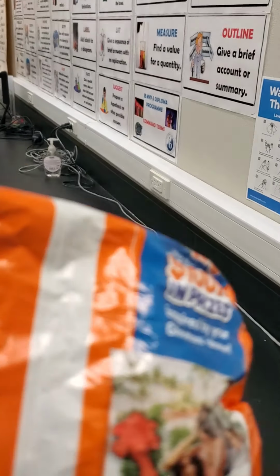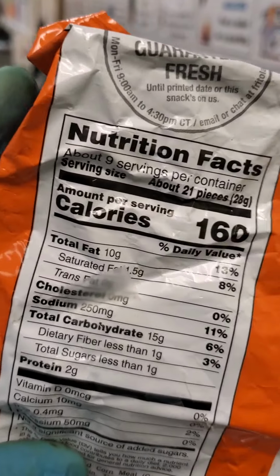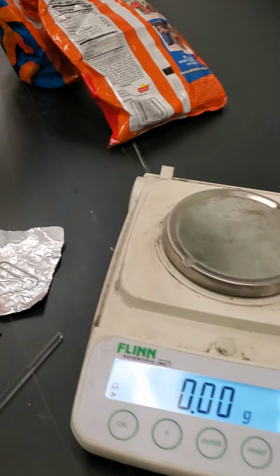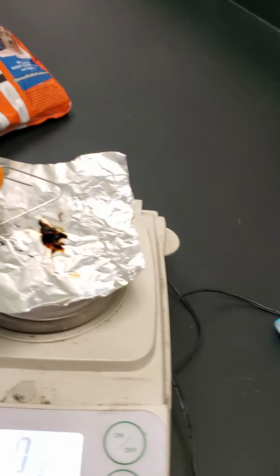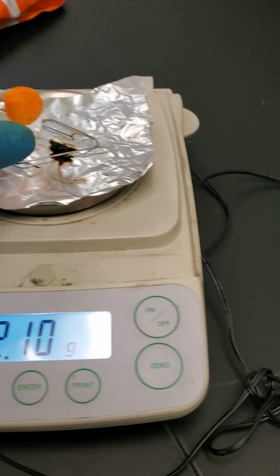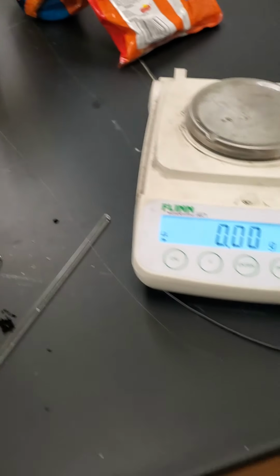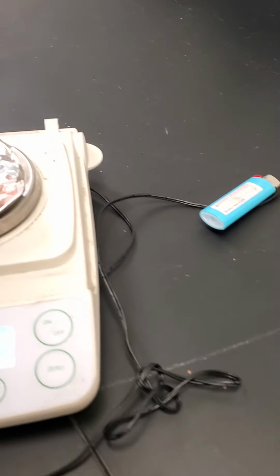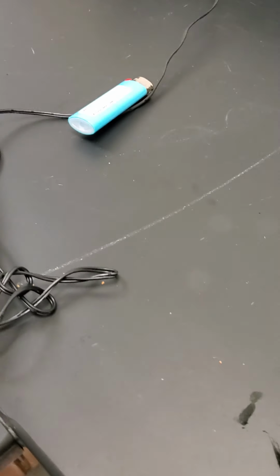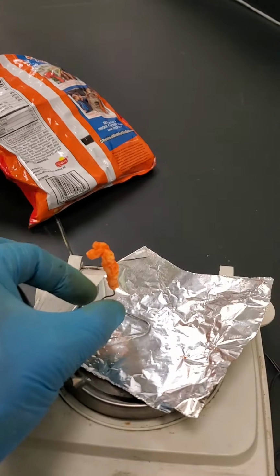And then we have crunchy Cheetos, with that being the nutritional information. Now what we're going to do is first get the mass of the three types of Cheetos. So here's the cheese ball. So there's our balance. Here is the Cheeto puff. And then here is the crispy Cheeto.